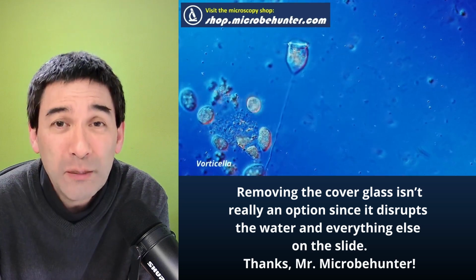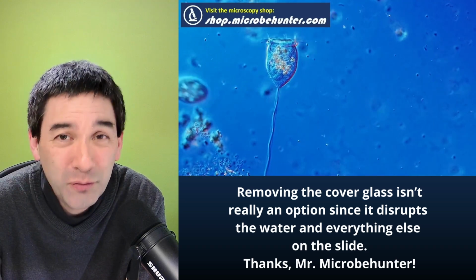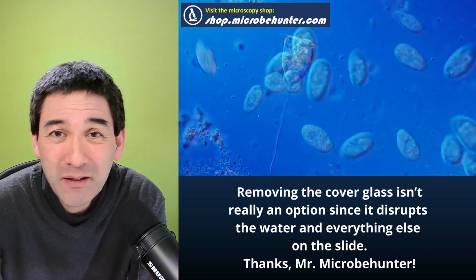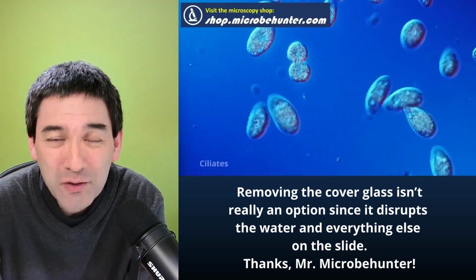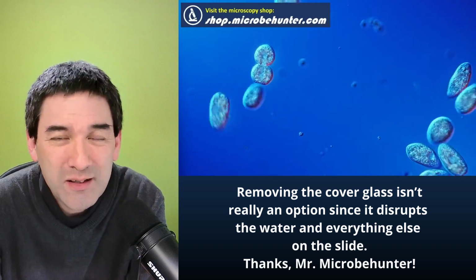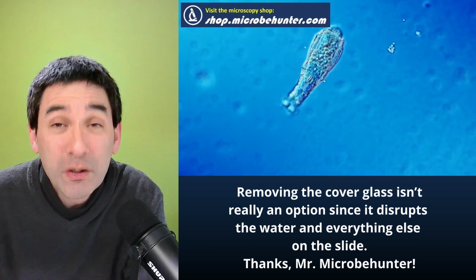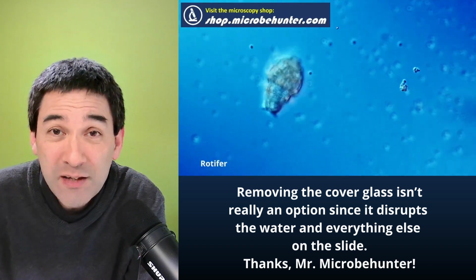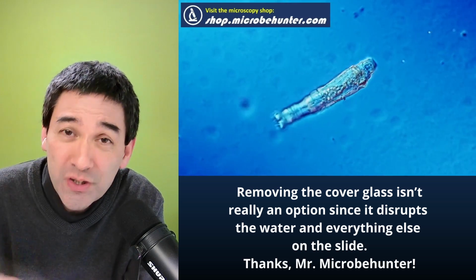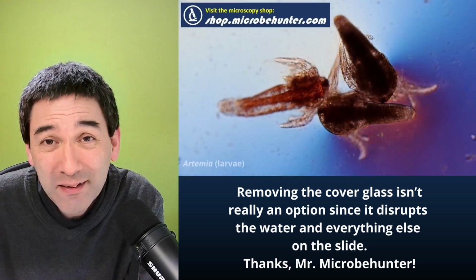Yeah. So this is only possible without a cover glass. Removing the cover glass is not an option because if you remove the cover glass, then you're kind of losing the specimen again, because maybe it's then sticking to the surface of the cover glass, and you have to find it again. So this is generally not a feasible idea. So what I usually do if I want to isolate microorganisms or microscopic animals, I never put a cover glass on top and just use the low power 4x objective because I need a large distance between the objective and the slide. This gives me enough space also for the pipette to pick it off.